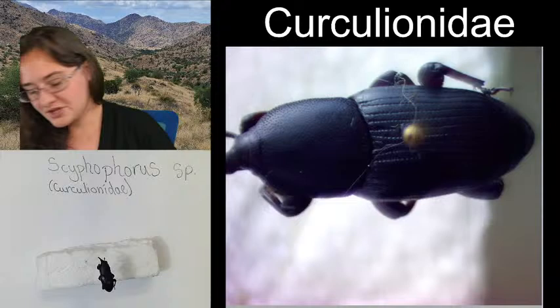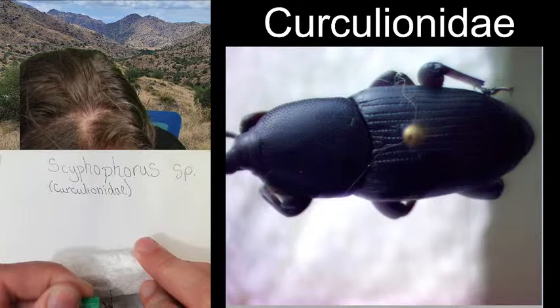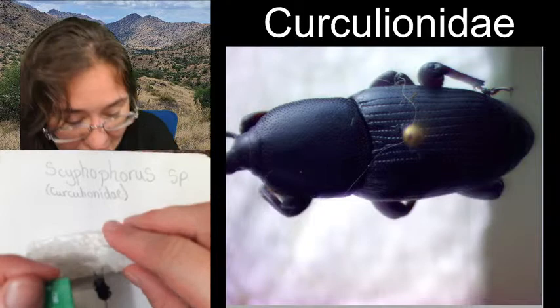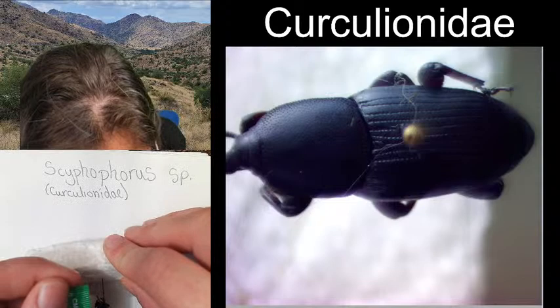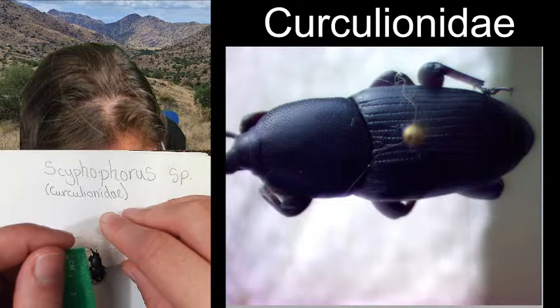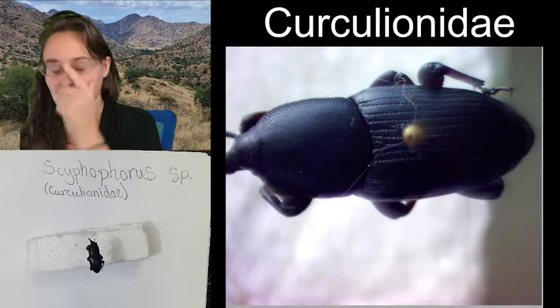I know that a lot of you guys who are nature journaling like to know the measurement in centimeters, so I'm going to go ahead and start from the very top of the snout and kind of try and round it off as I go around so that I add the snout into the measurement of our specimen. So our specimen is about 2 or 2.1 centimeters. It could be just a little bit over 2 centimeters long.